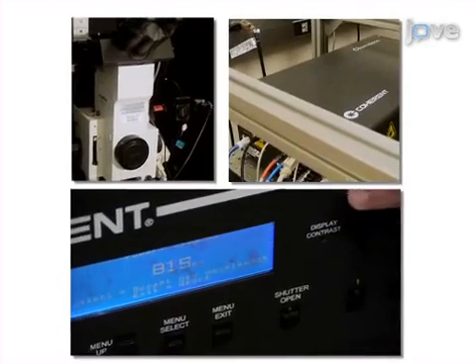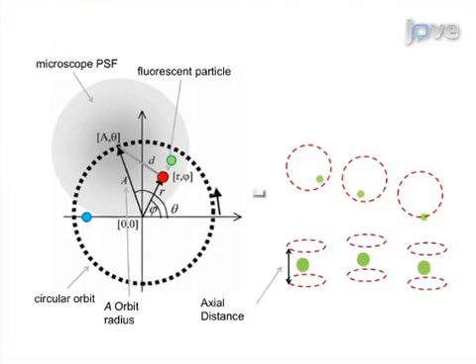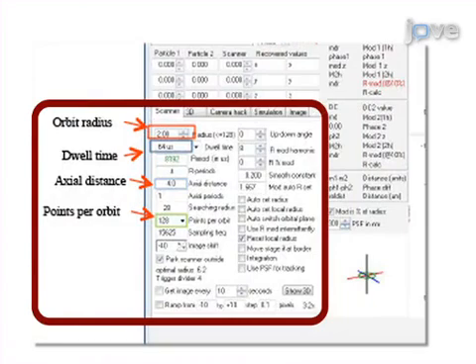The second step is to use a laser scanning microscope and employ the orbital tracking method to follow the lysosome movement at high speed. The size of the orbit and other parameters such as the frequency response of the system are then selected to perform tracking experiments.